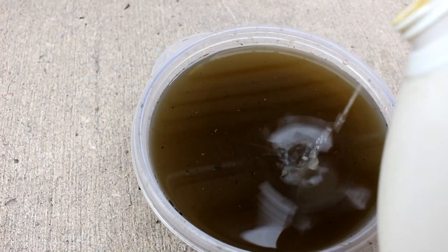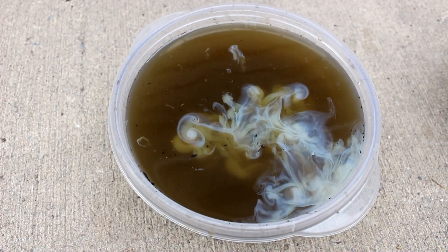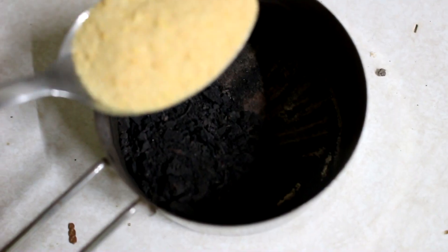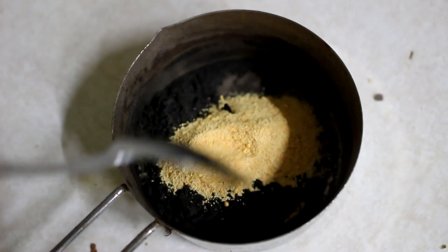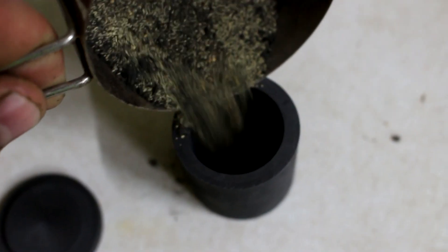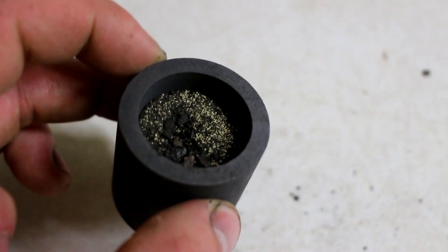I'll furnace all the ashes together. But look at that — white silver chloride's forming. Here's the sludge that settled out of the solution, and now I'm going to dry it out. Now that this is dry, I'm going to add in a spoonful of assay flux. This contains litharage, which will collect the silver together into a bead. And now I'm going to add it to this graphite crucible. Let's pop this in the furnace and melt it all down.